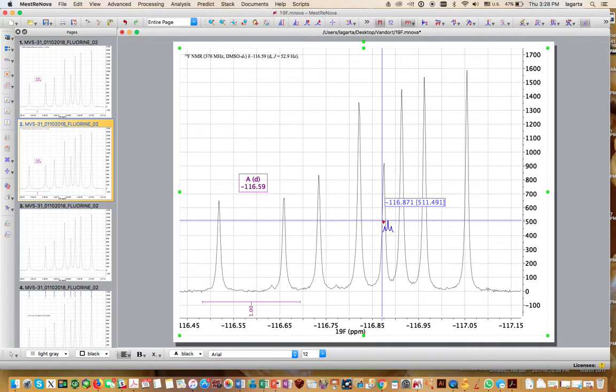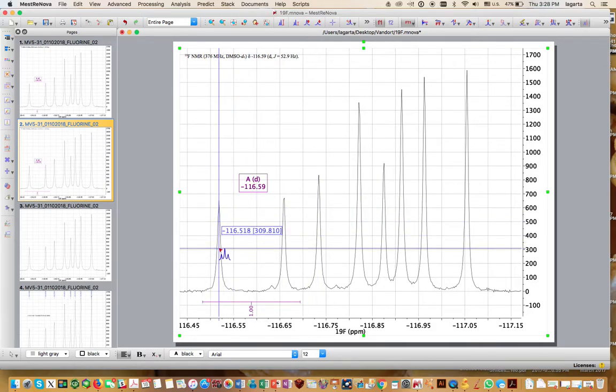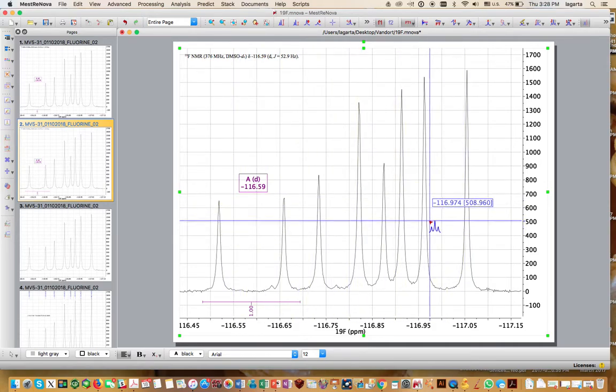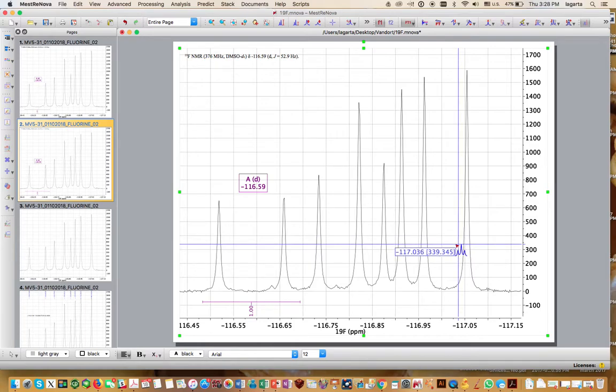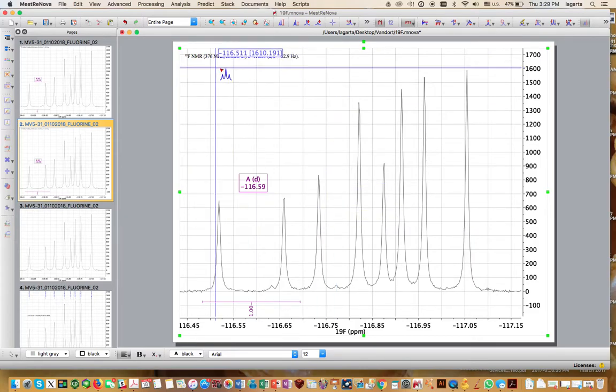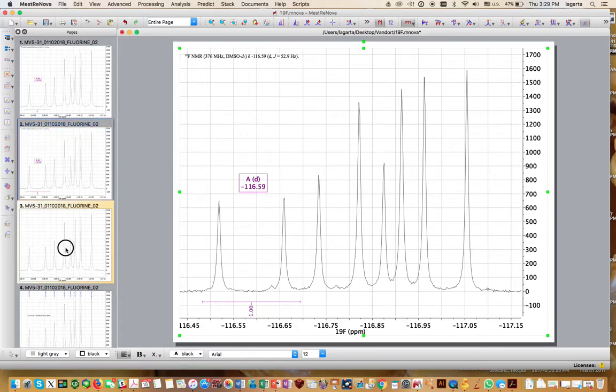Now this is all good, but when you want to do specific J-couplings, let's say between this peak and this peak, or at the same time, I think the best thing to do is to actually do manual peak picking, and then do the subtraction and multiply by the frequency. So to do that, let's start from another fresh spectrum.